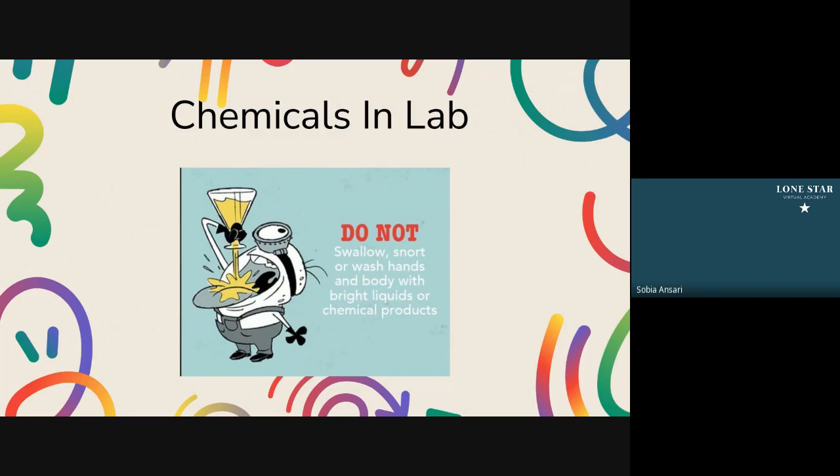And always make sure the chemicals are labeled, because this will tell you what type of chemical it is. In an emergency, you are able to let your teacher know which chemical you were dealing with.